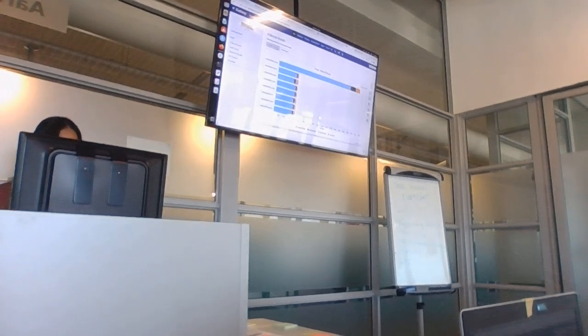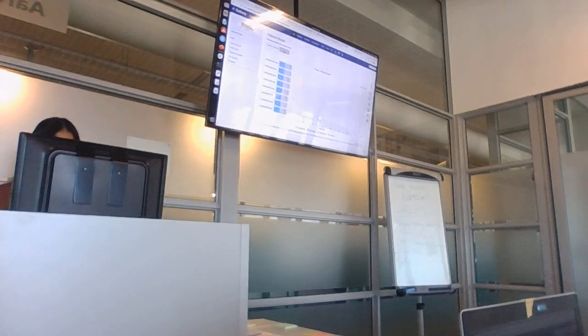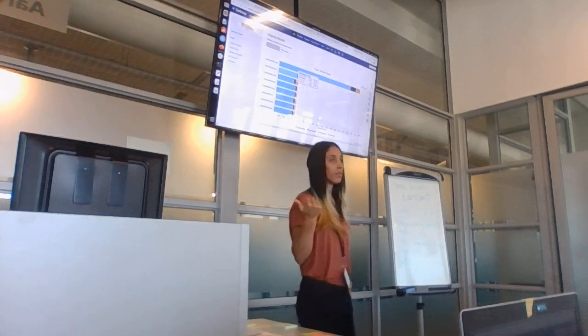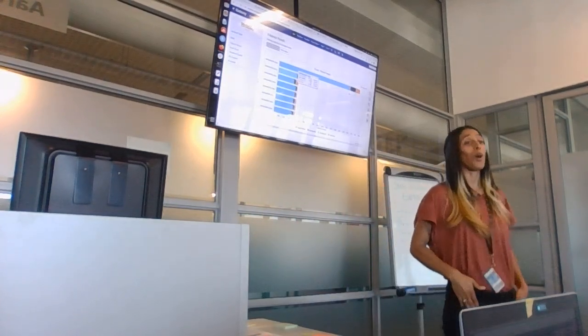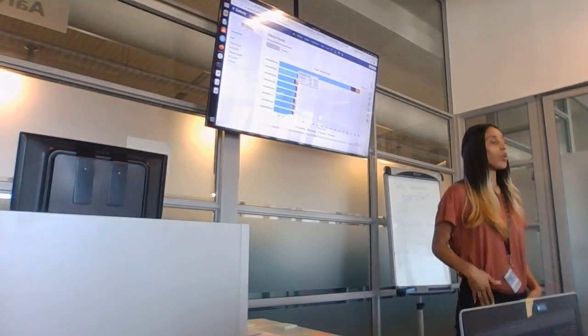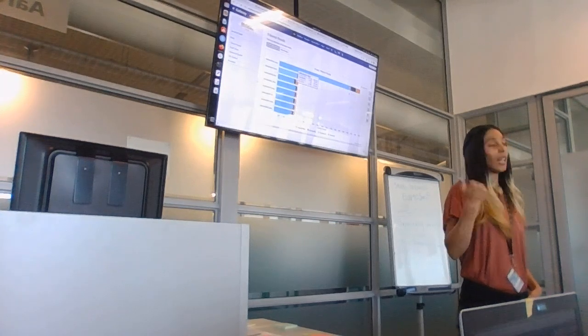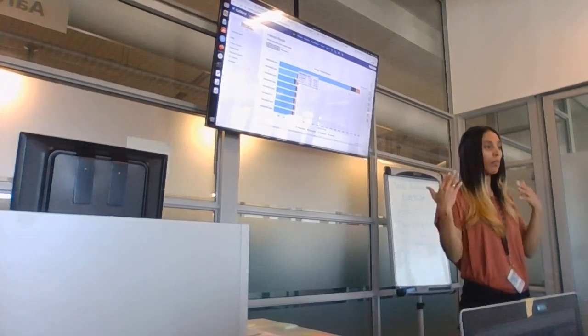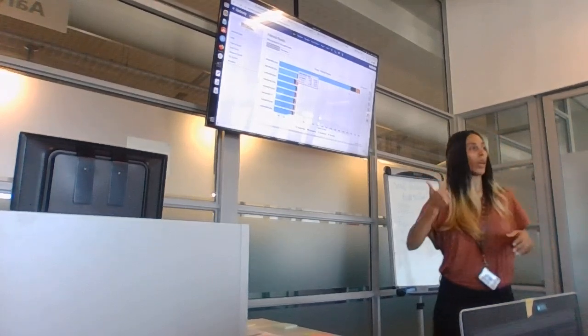So this is giving you the number of reads. Is it not weird that this file is way longer than the others? Now I did subsampling. Actually, there's a lot wrong with this data set. It's a preprint, and all of these samples were much bigger. I just did some subsampling, so basically I made them shorter so that they can upload faster. But this one was already quite short.